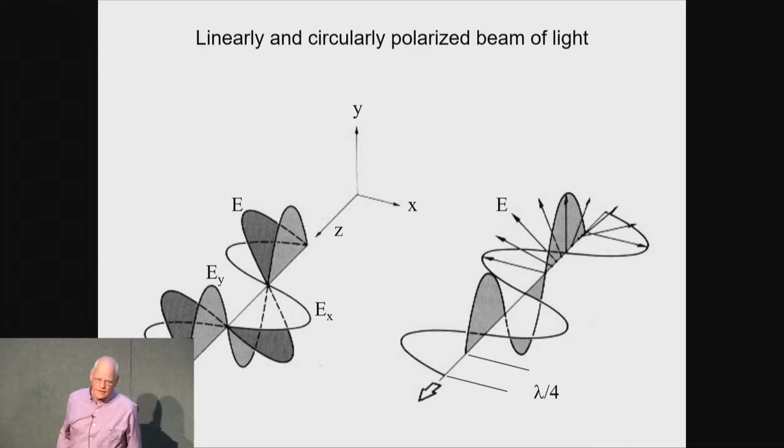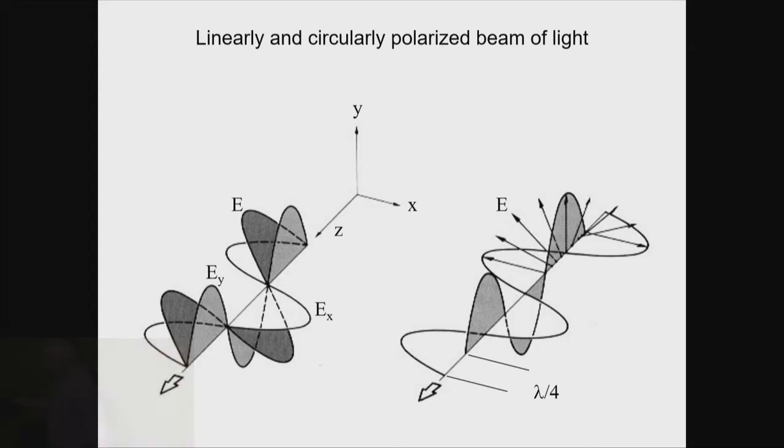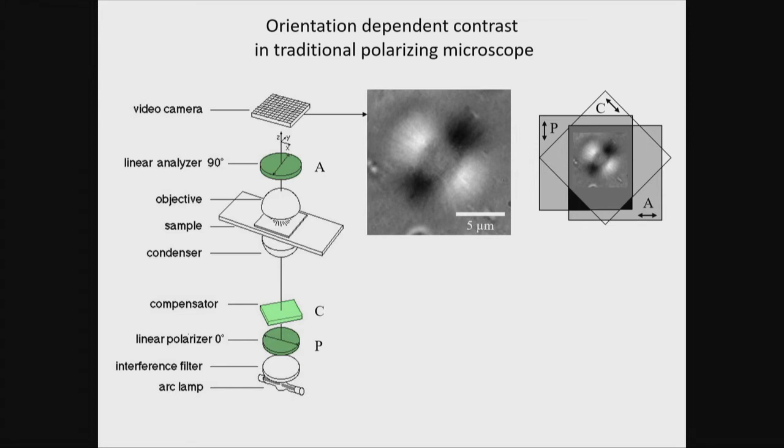And that's essentially what a polarized light microscope is, only that you have microscopic optics, not macroscopic optics, like in your eyes. And so we can do that later if you're interested. So these are the demos. And then this is a traditional type polarized light microscope, where you have traditional type optics, microscope optics from an arc lamp. Down here, you typically need a good amount of light.